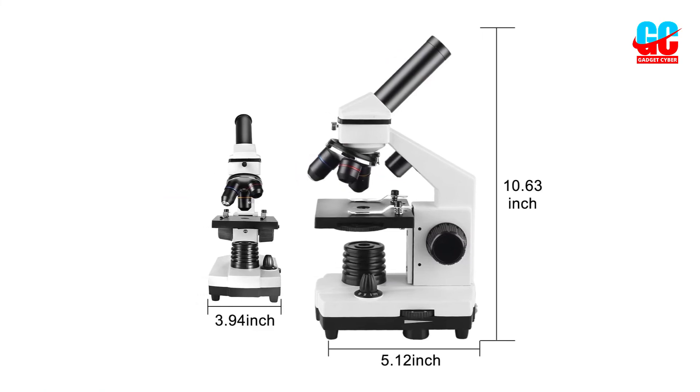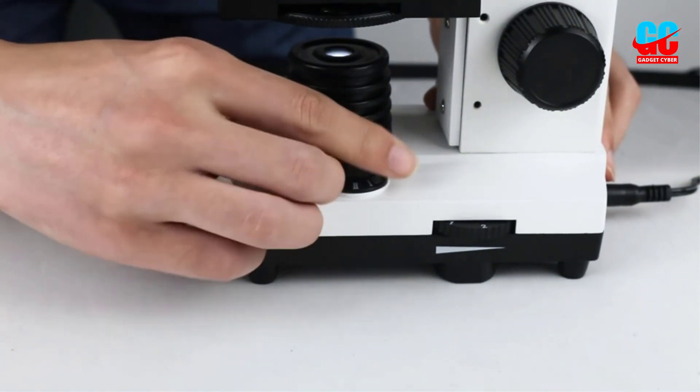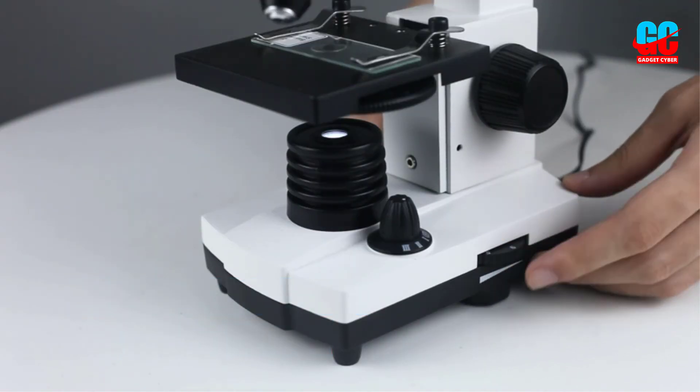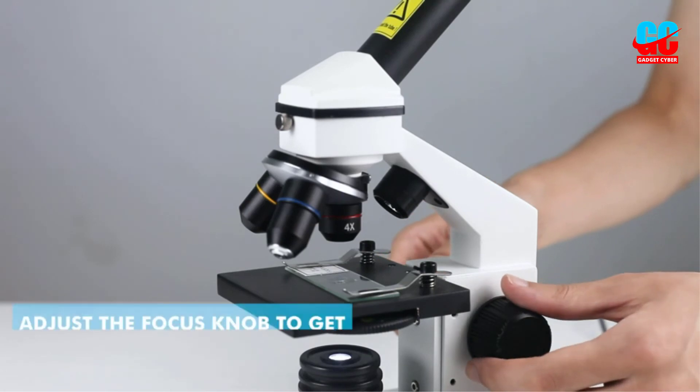That said, it also includes a smartphone adapter that allows you to take pictures and videos of whatever you're viewing. We also appreciated the dual LED illumination system that supplies light from below and above the specimen.